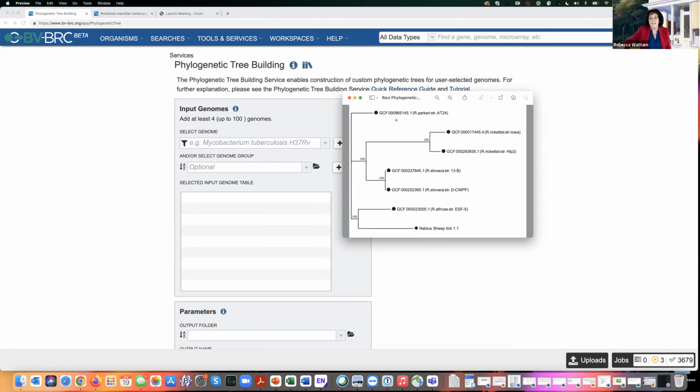And one thing that they did that was very useful was they provided the assembly accession. What wasn't useful is that in some cases they got the letters wrong. Some of these are GCA, not GCF. And this actual accession is to a closely related but different genome. But nonetheless, everybody makes mistakes. It's not a big deal. But I just want to show you what you can do with this kind of information.